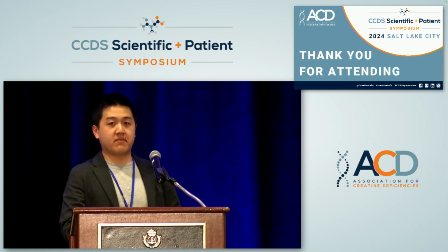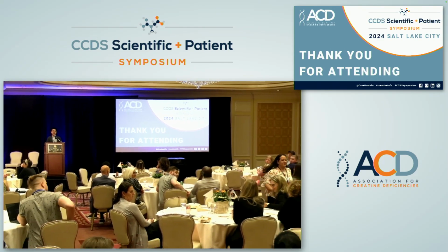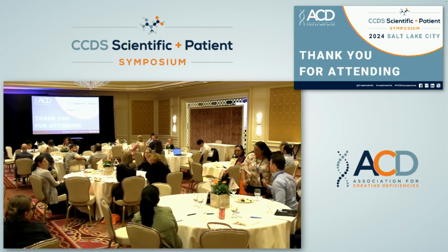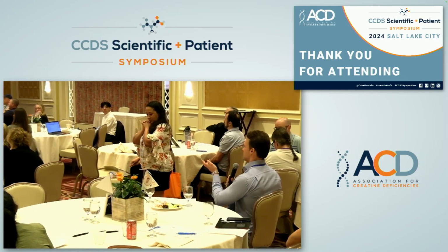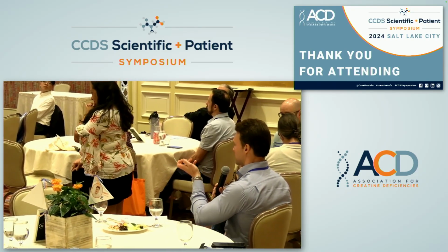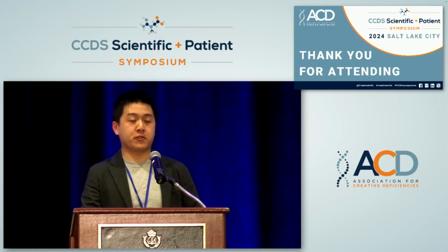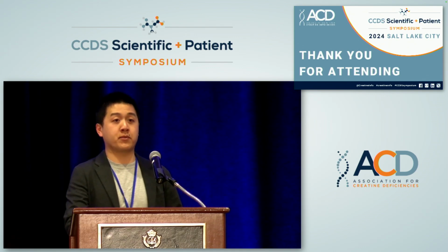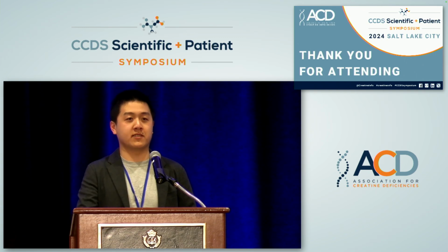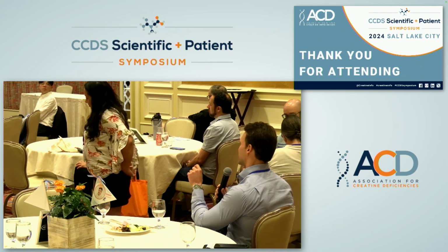Perfect, thank you. And are there questions for me? Cool, Alex. Great talk. So with all the organs, are you preparing homogenates and then measuring in total homogenate solution? Yeah, for mouse tissues, we typically just use whole homogenates, and then we normalize the data based on the amount of tissue we've used, just because it's difficult to get accurate protein quantifications from tissue homogenates.